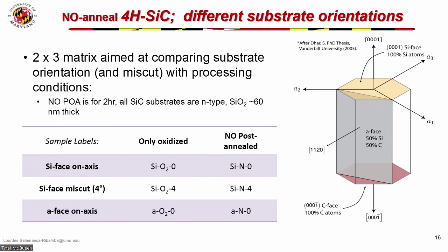So we wanted to see what the difference was by growing the oxide on the a-face compared to the silicon face and the 0001 face. Some samples were only oxidized and some samples were annealed for 2 hours in nitric oxide.